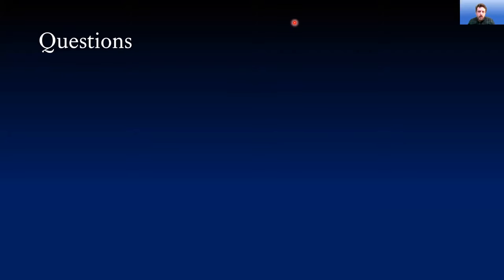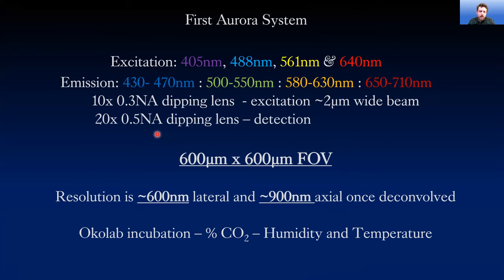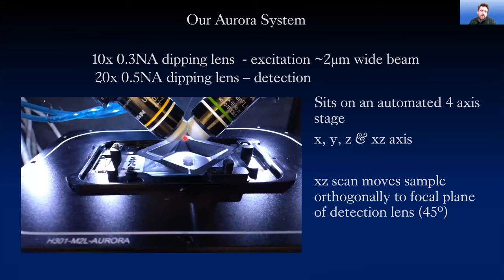So there are two lenses side by side, one to project and the other to detect the image. Is that angle the best optimized angle, or if the angle is different, can we see more depth? The angle, perhaps if I pop back to that particular slide. That's essentially formed because the beam comes out orthogonal to the direction of that lens, and then where you want that to be is in the focal plane of your detection lens, which is itself orthogonal, parallel to the base of that.